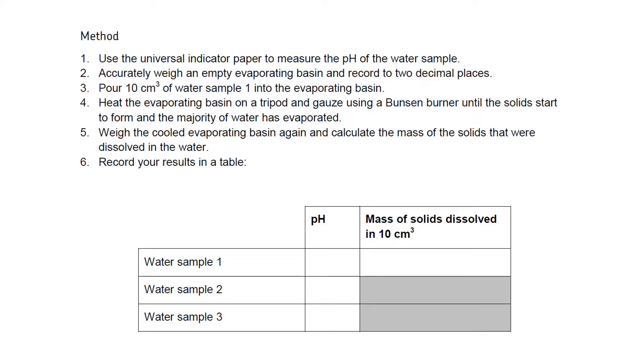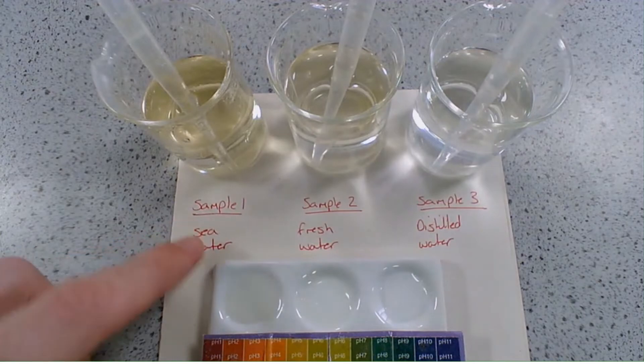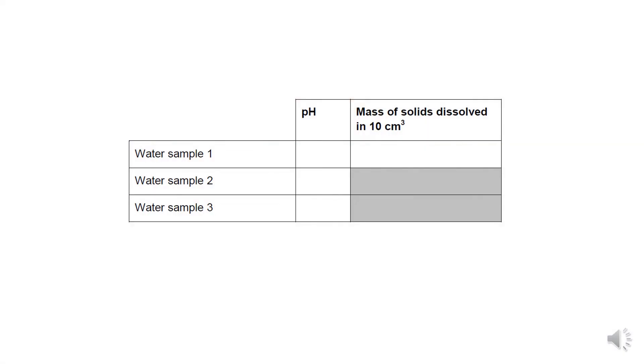The first thing we're going to look at is the pH of our different samples of water. We've added a few drops of sample 1 seawater, sample 2 fresh water, and sample 3 distilled water to our spotting tile, and using universal indicator we're going to record the pH. Sample 1 seawater gave a dark green colour indicating a pH of approximately 8. Sample 2 fresh water gave an orange colour indicating a pH of approximately 6. Sample 3 distilled water gave a pale green colour indicating a likely pH of 7.